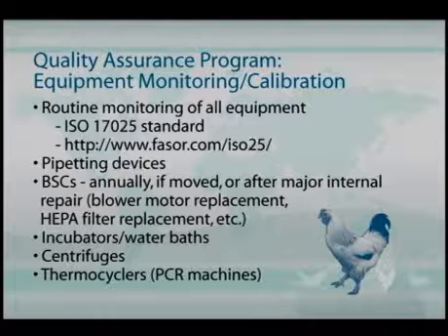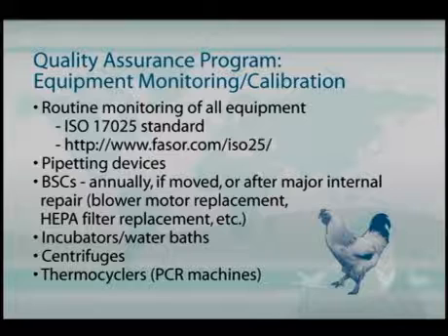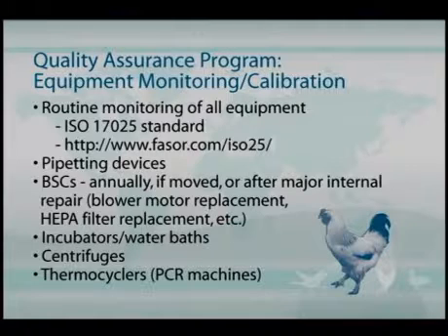Then anytime you move a biological safety cabinet, these have to be rechecked to make sure that they are working as they are designed. And of course, monitoring on a daily basis incubators, water baths, centrifuges, thermocyclers, to make sure that they are performing up to the standards that are expected.